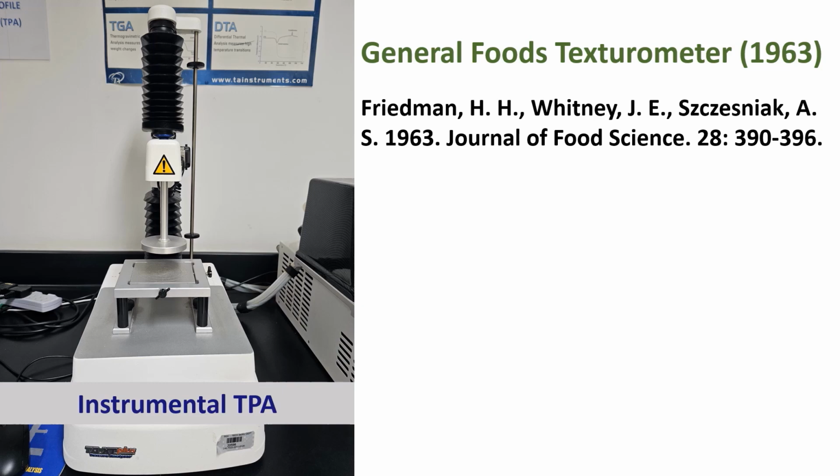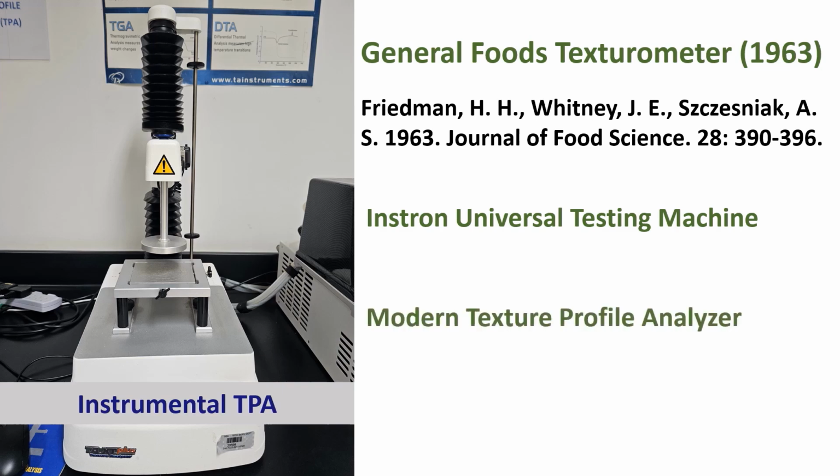In the late 1960s, the major milestone was achieved when instrumental TPA was adopted by Instron Universal Testing Machine. Recently, modern computer-assisted TPA provides great versatility.